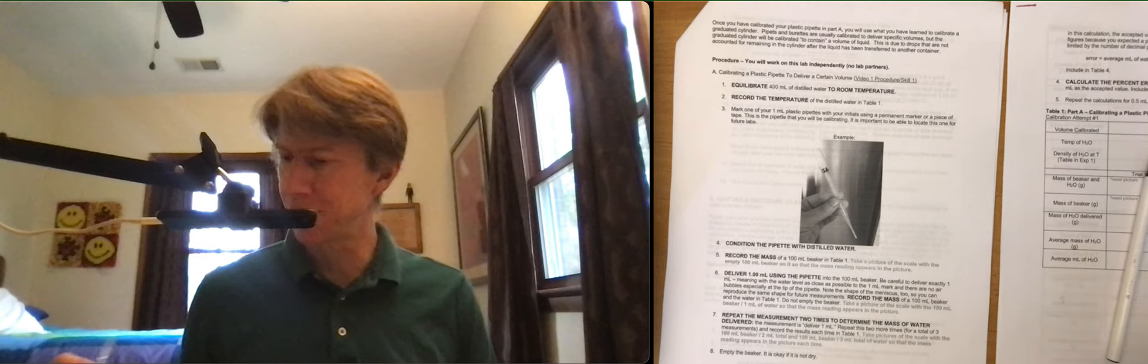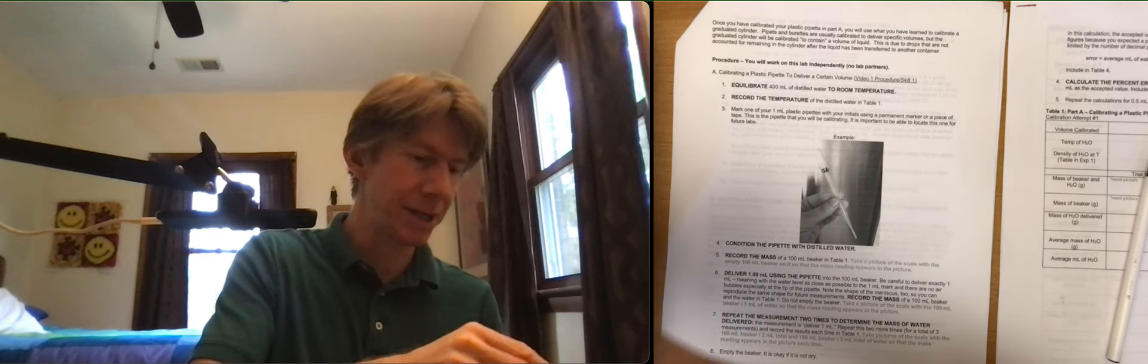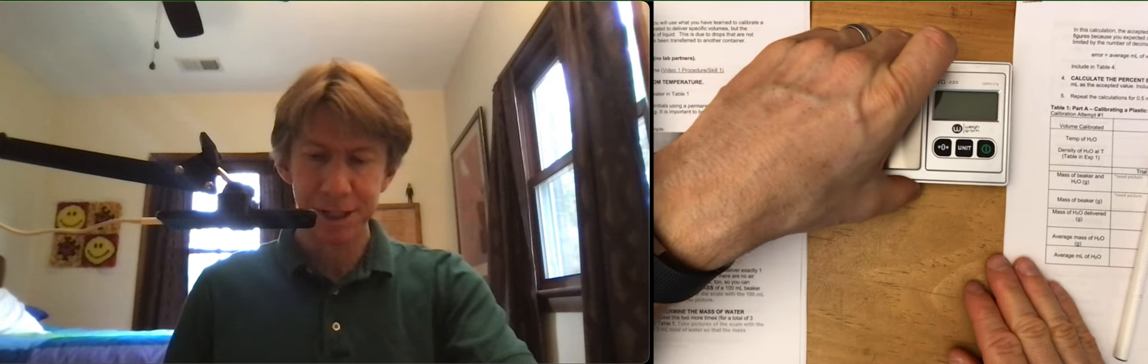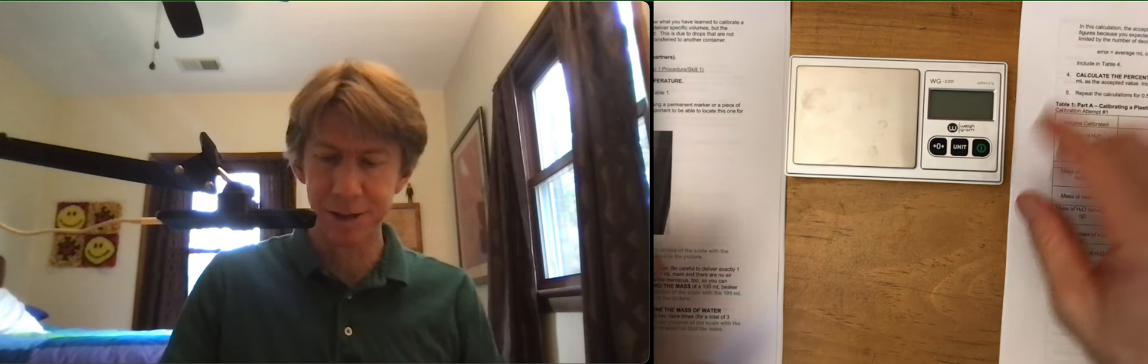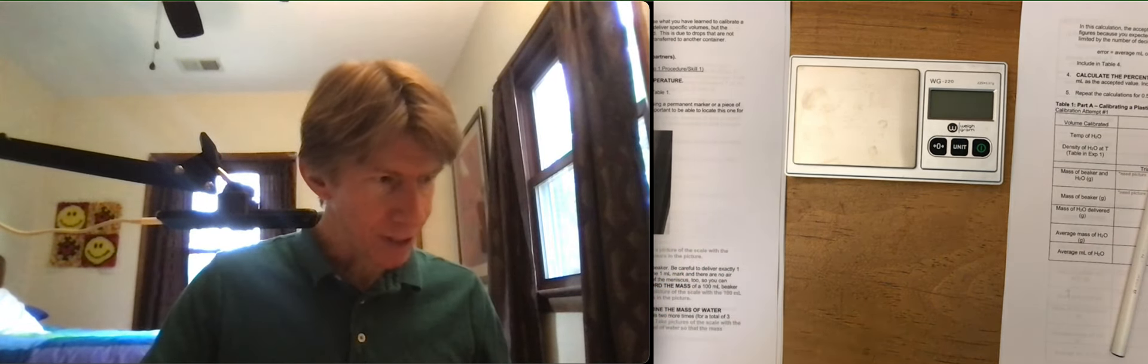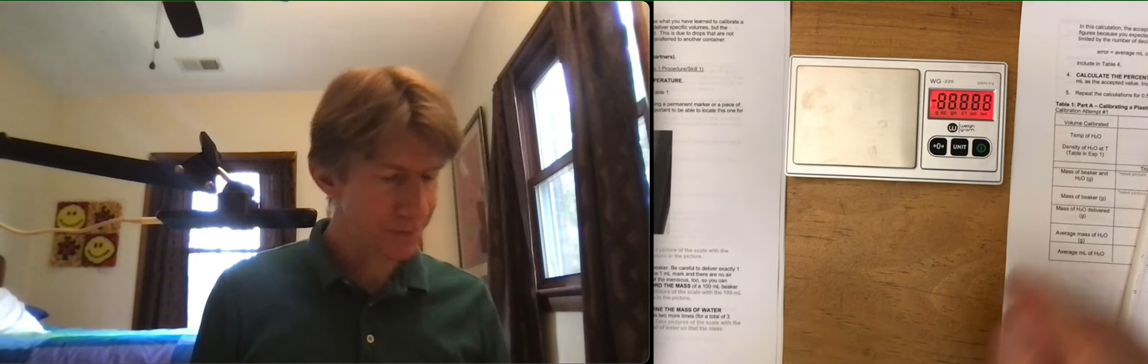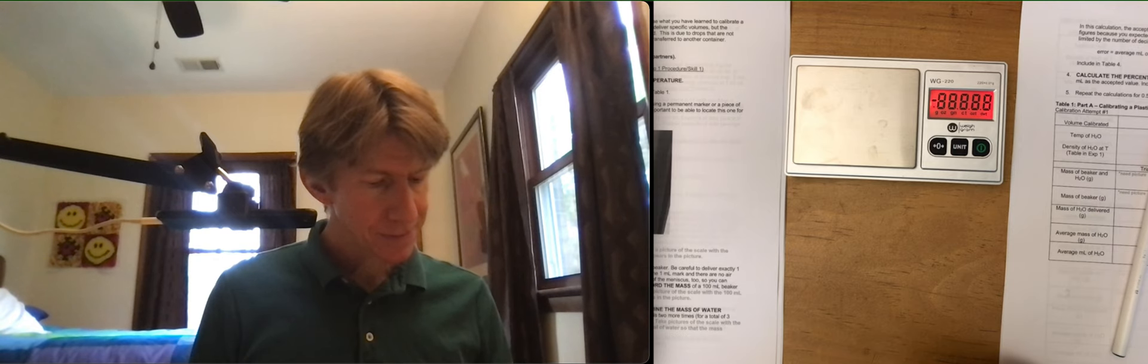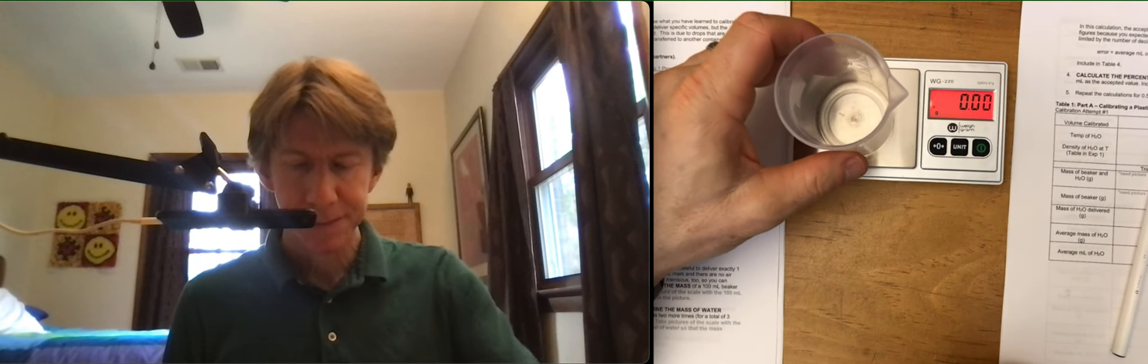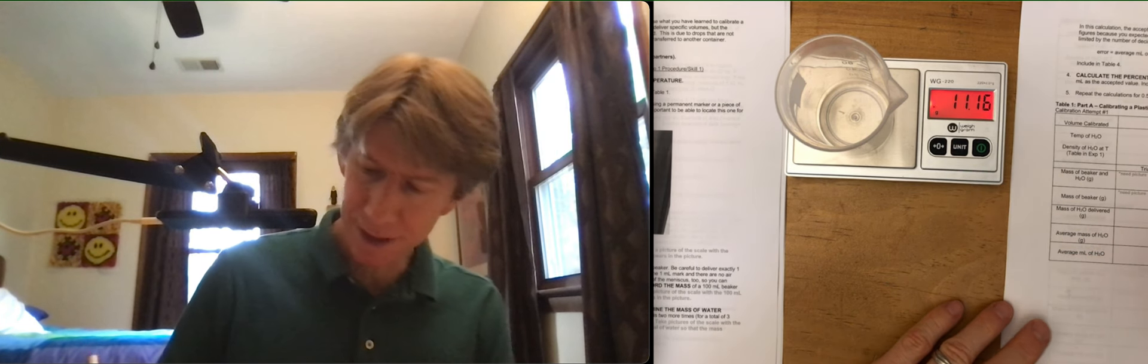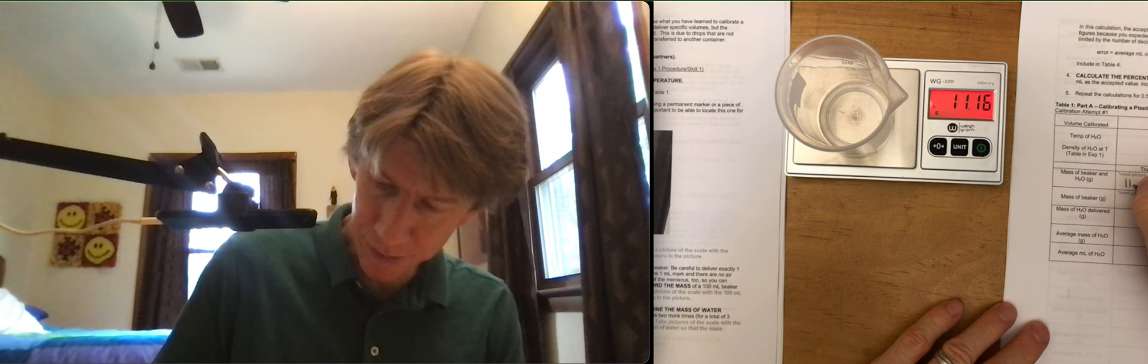Record the mass of a 100 milliliter beaker. I'm going to put my pipette in my water. Get my scale positioned here. Nice flat surface. I am weighing a 100 milliliter beaker, just double-checking that it's clean and dry. Once it's on there, you're going to take a picture of this, because that's one of the things that needs to be submitted. 11.16.